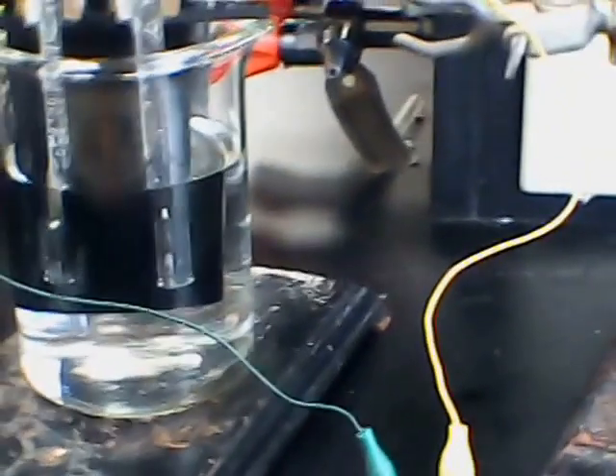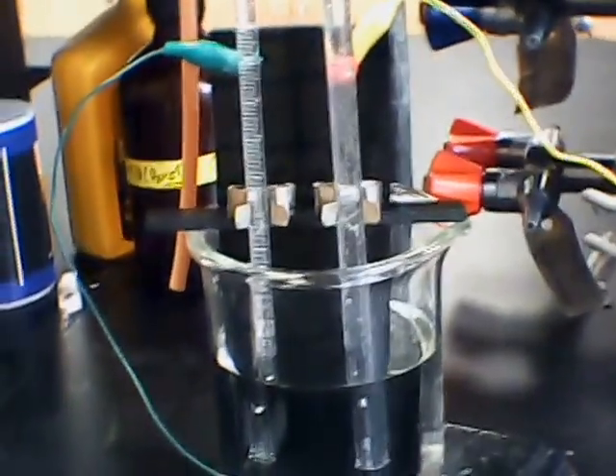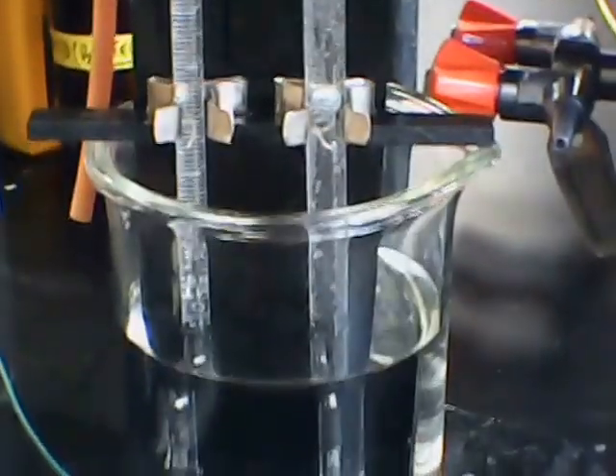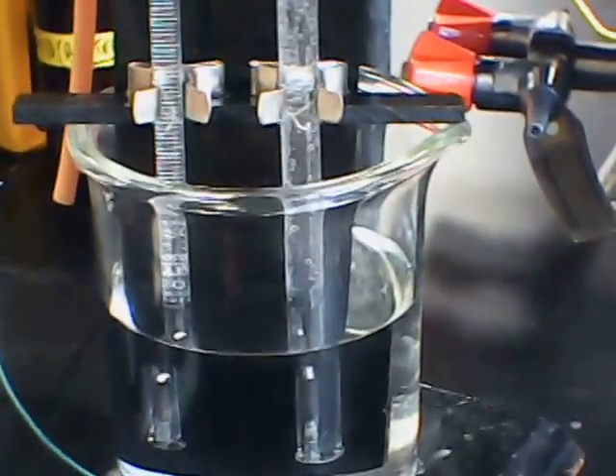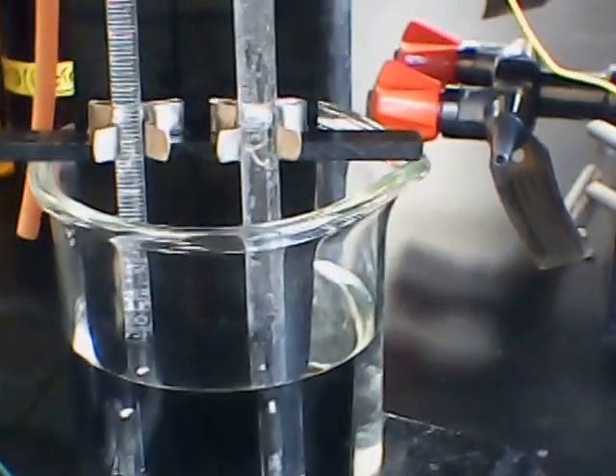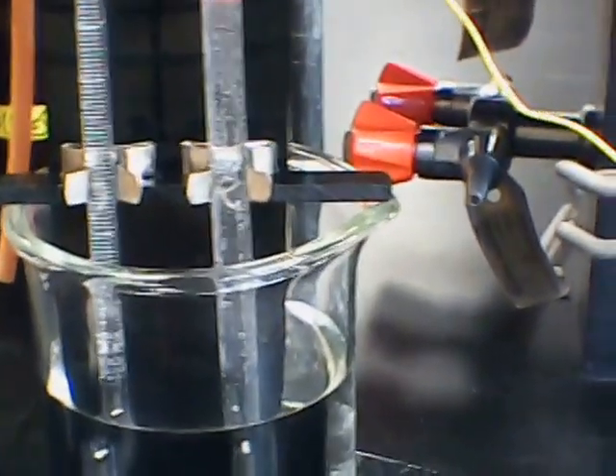Hi, I'm Dave Soriano. I'm a chem professor with the University of Pittsburgh's Bradford campus in Western Pennsylvania, USA. What I have here is just a little demo of water electrolysis. I'm using a Brownlee apparatus, which is a conventional simple apparatus for demonstrating electrolysis of water with collection of the hydrogen and oxygen gases.